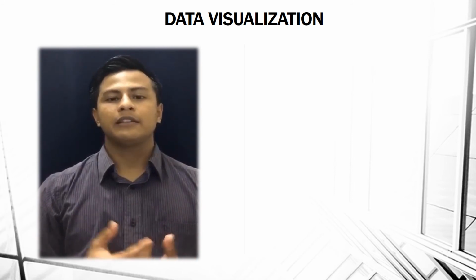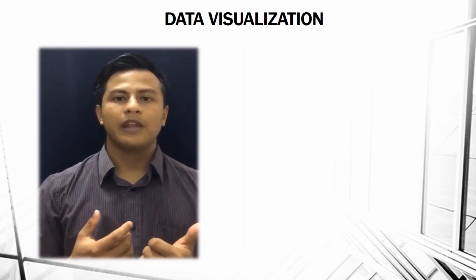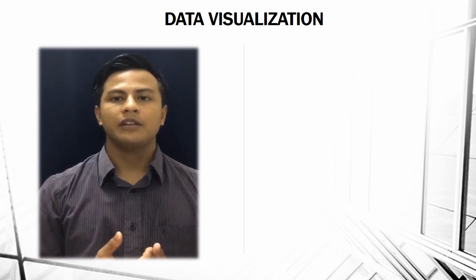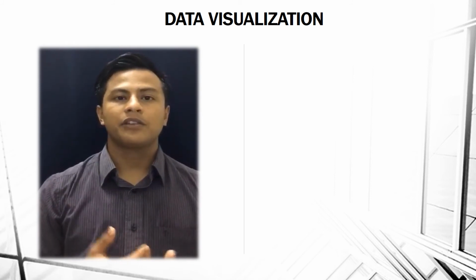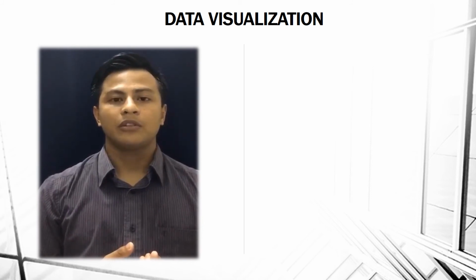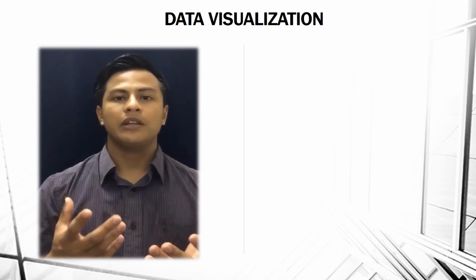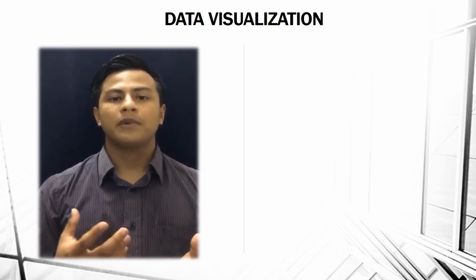In this study, the chromatogram used two methods, which are HTGC and 2D-GC. Most of the HTGC data is visualized in 1D version. For 2D-GC, it is visualized in the traditional 1D version. The 2D version is a contour plot and the 3D image is a surface plot. The figure of the 2D-GC contour plot shows the advantage of the 2D-GC structure. So it clearly shows that there are a variety of groups in the 2D parts.